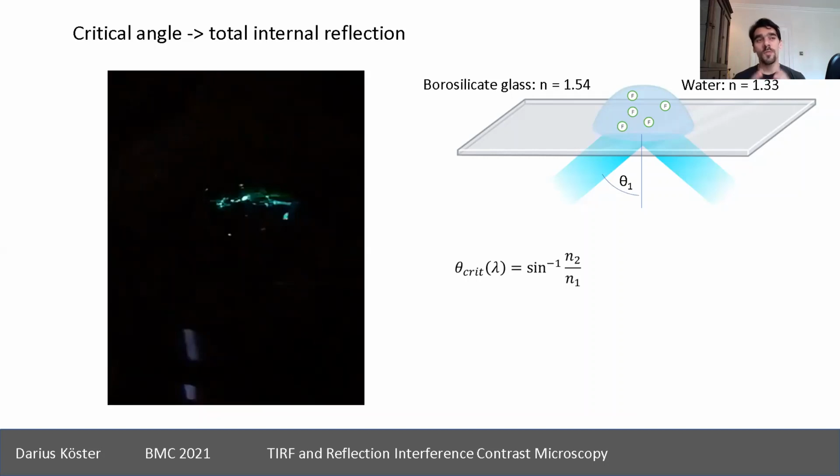Another way, when your sample is not even, is to take lots of different fields of view, let's say 100 or 1,000, just do a stream where you move around, and then you take a median of that. That normally gives you how your illumination field looks, because you get the median of signal from all your different heterogeneous fluorescently labeled patches, and that will average out to something more or less homogeneous. So that's the way to go about that.